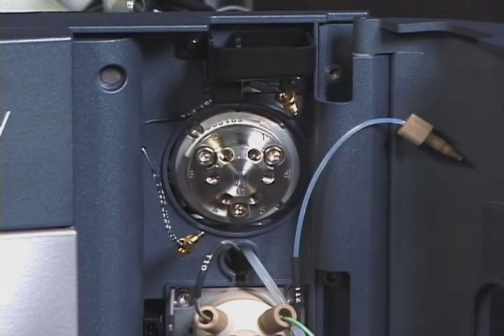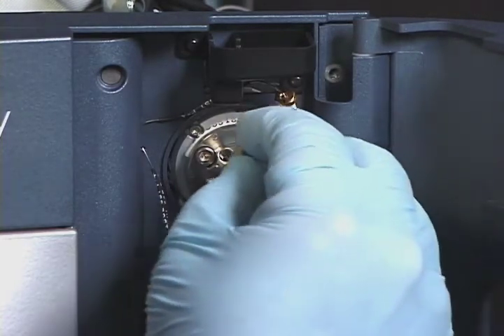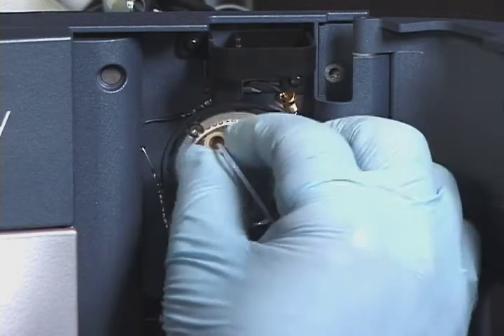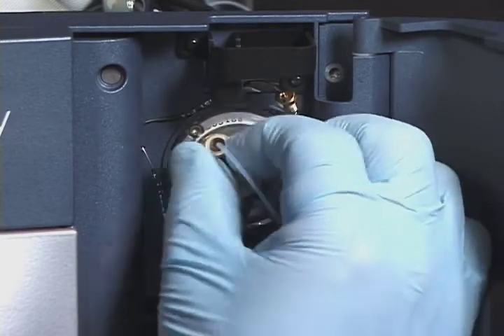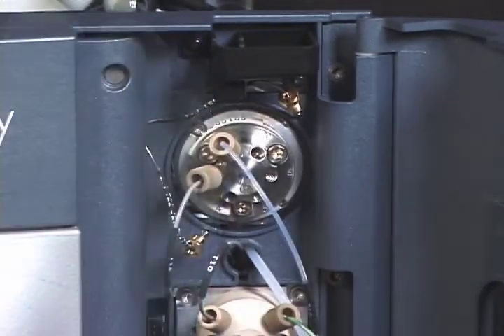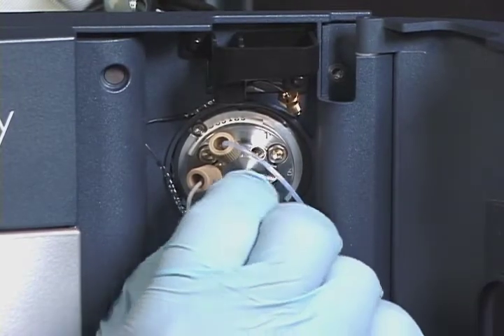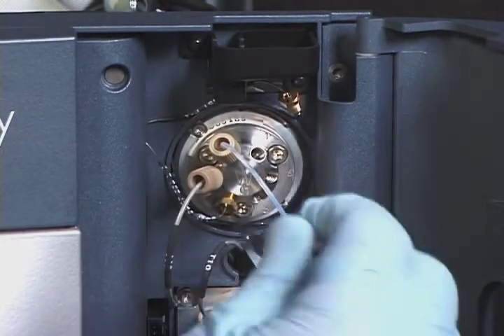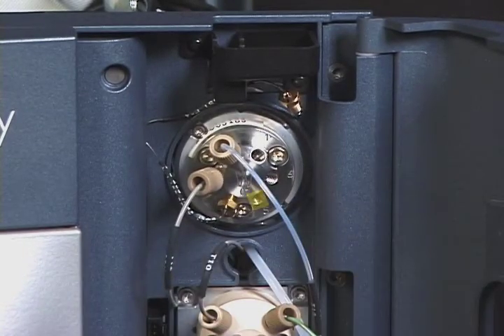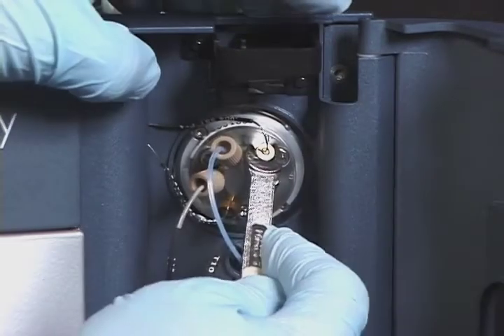Reconnect the following tubing and ensure that all tubing is seated all the way into the bottom of the fitting: the waste tubing to port 2, sample syringe to port 3, needle to port 4, quaternary solvent manager to port 5, column to port 6, and the seal extension tube to port 1.